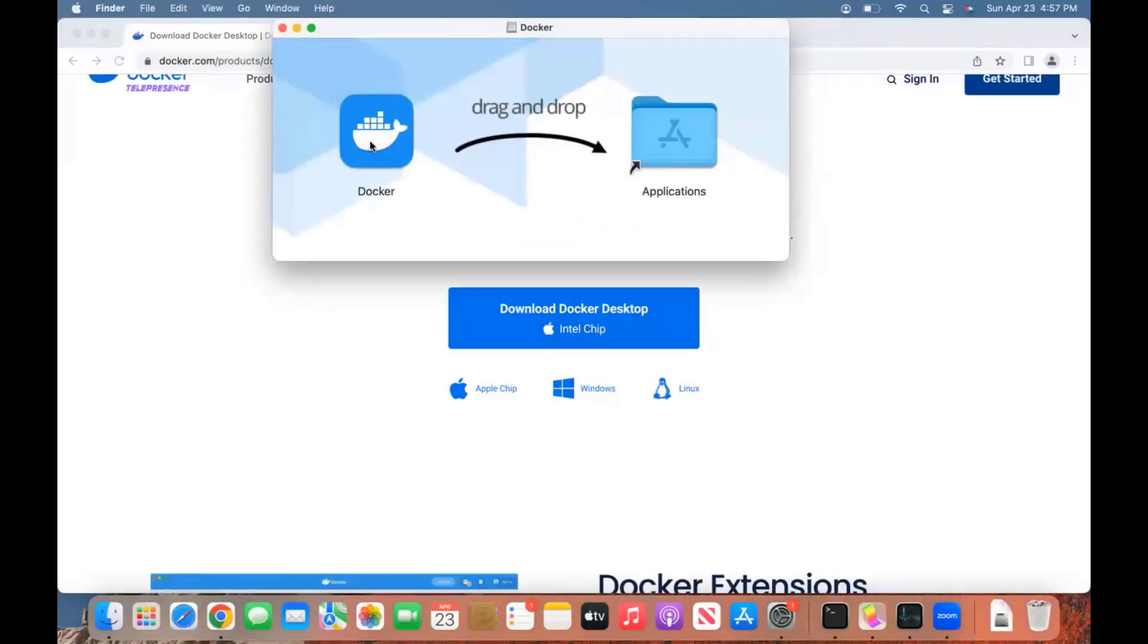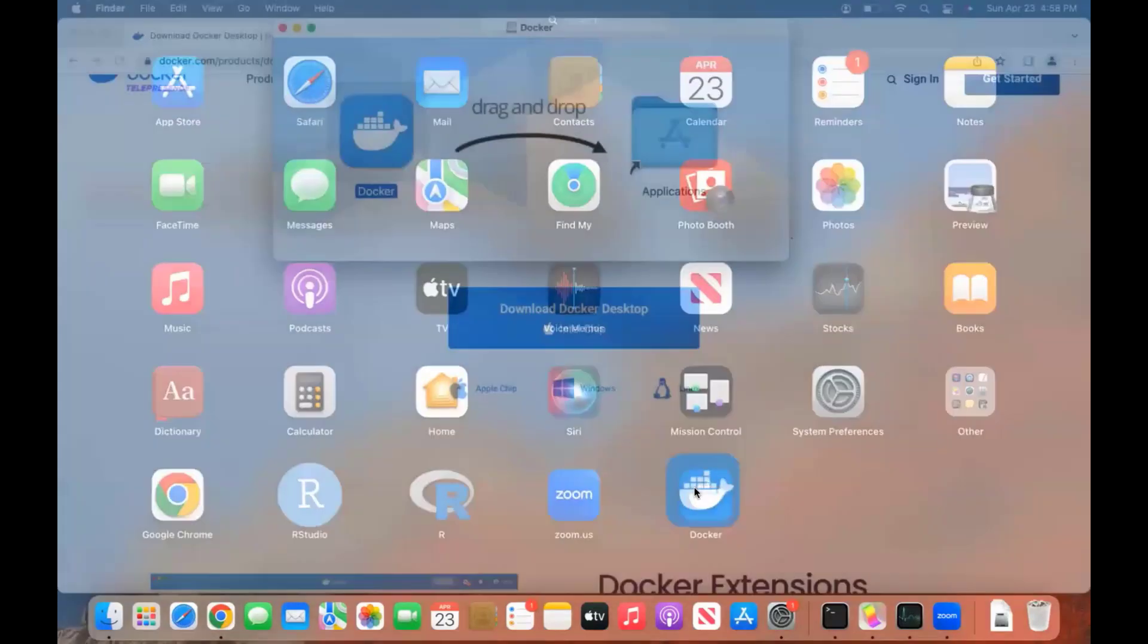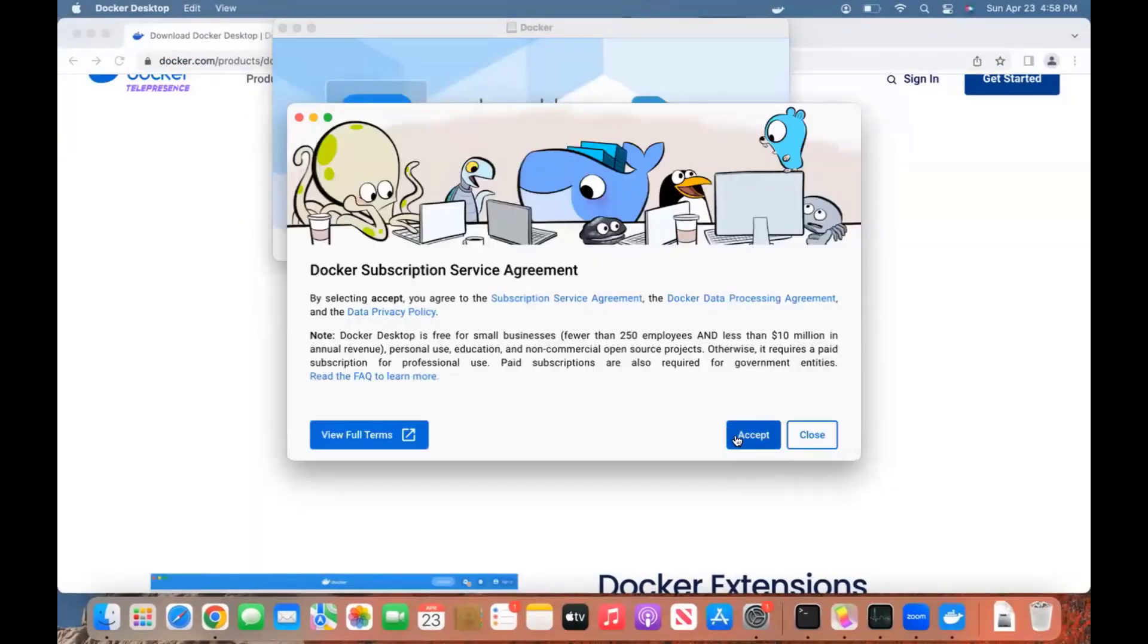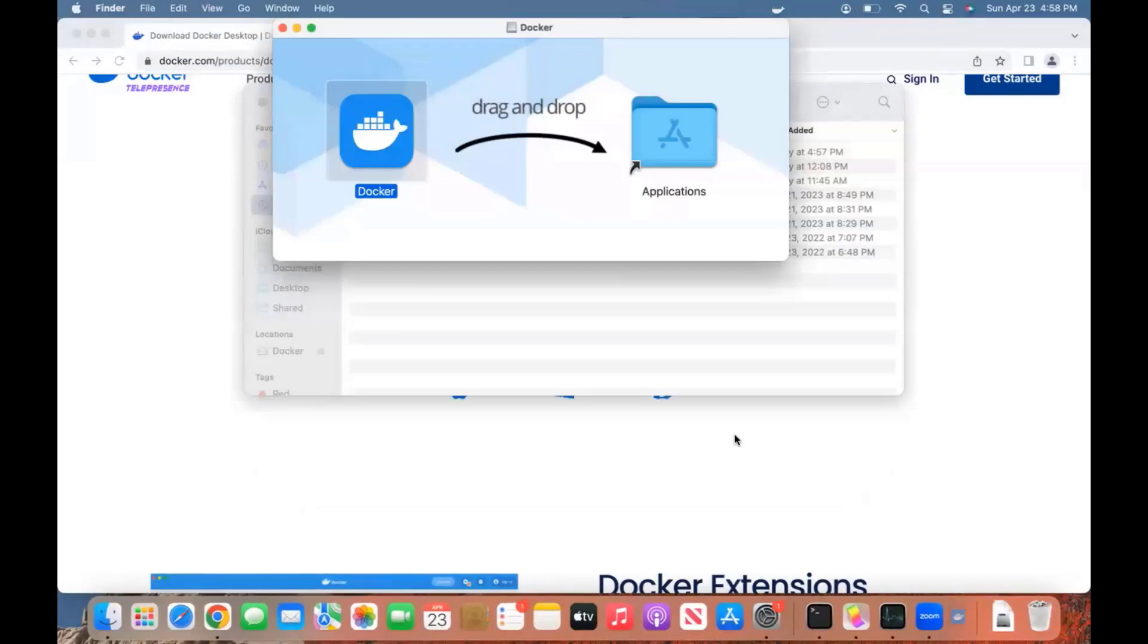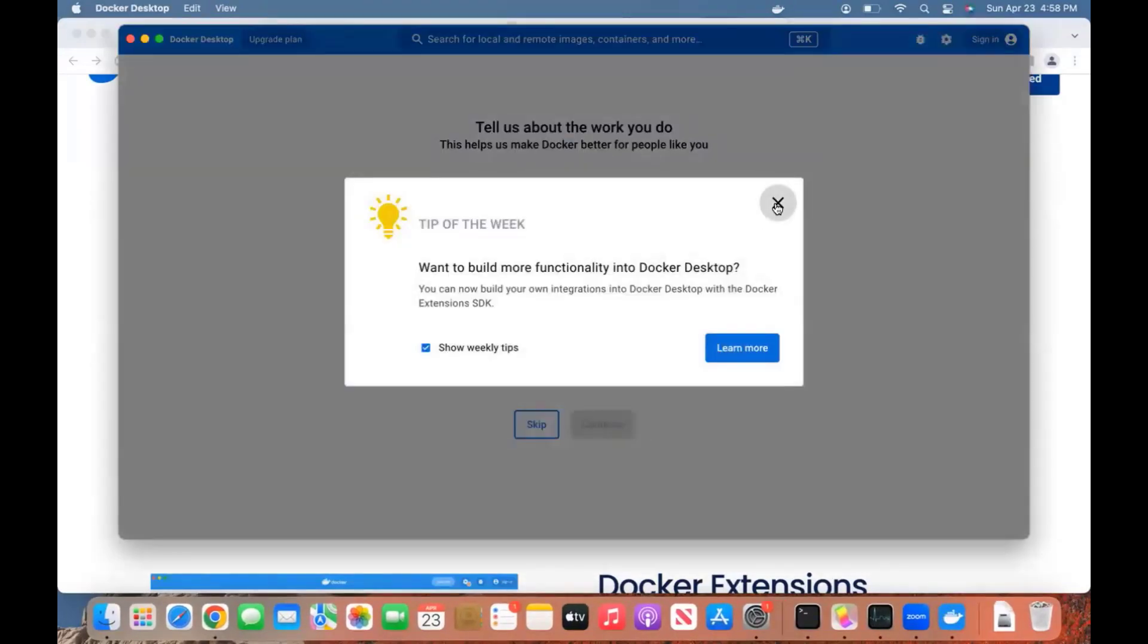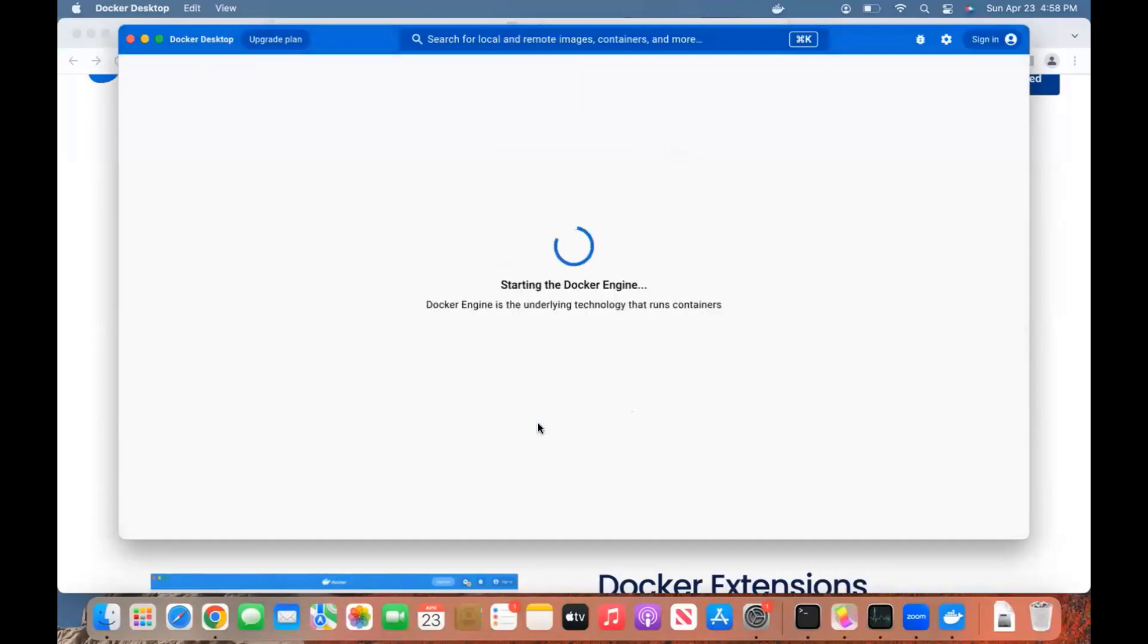Open this, and all we need to do now is, as you can see from the popup, drag this to Applications. You can double-click here to open it. I'll skip this.